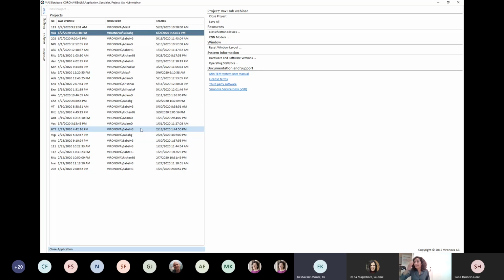Yeah. Okay, so I think this text is probably going to be the smallest text you can see. I will bear that in mind. I will try to zoom in. You don't need to read any of this text here, but thank you for pointing that out, and I'll make sure that I zoom in on some of the areas. If you think that it looks too small, give us a little heads up. This is unfortunately as big as I can make it, as it's a full screen on mine, but I'll bear that in mind. Thank you.